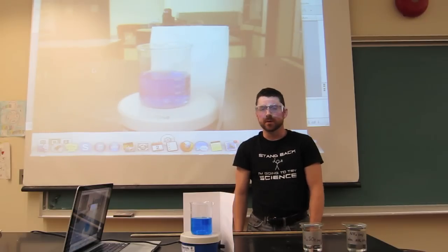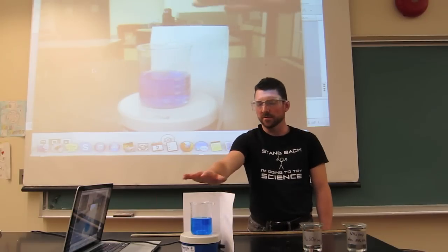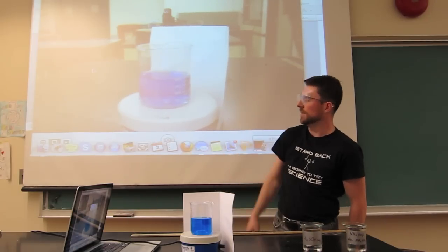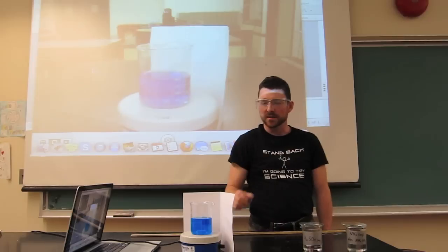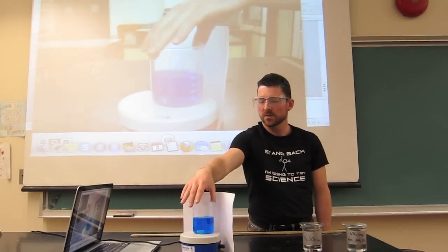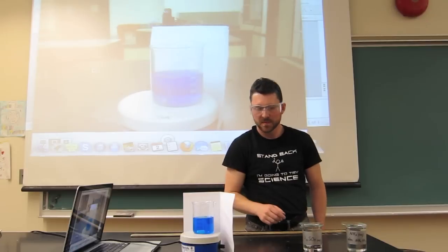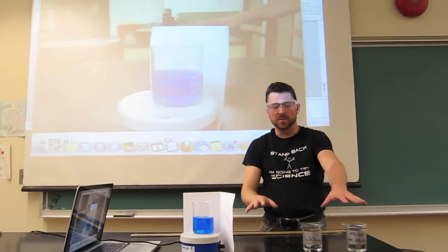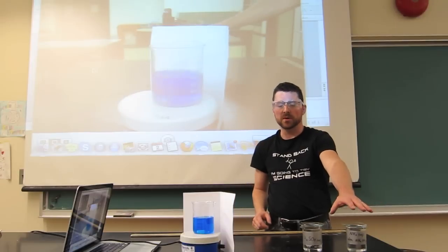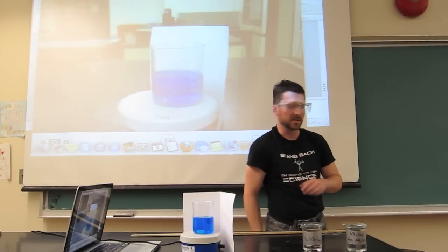This demo is called the Equilibrium Blues. The beaker in front of me, and also projected on the screen, is a solution of copper II sulfate, which has a typically blue color. I have two beakers on the side here. One contains aqueous ammonia, and the other contains sulfuric acid.